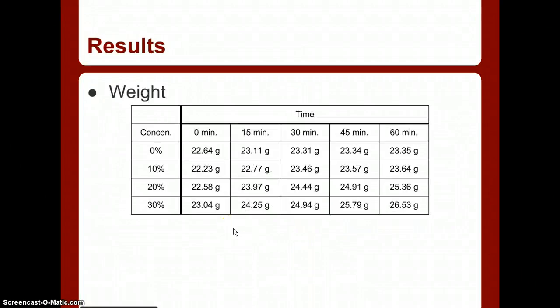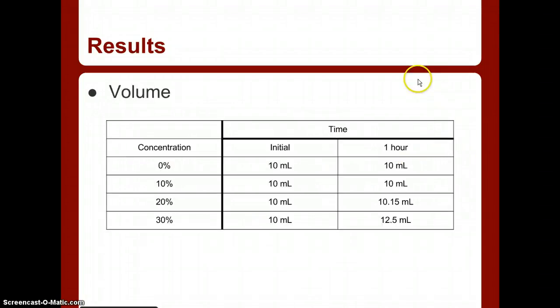Okay, I paused and went back a second just to make a correction. These two here generally change the same in weight, but as you move along, this one gains more weight as the 0% concentration. So then we did volume, which again shows a general trend. As the concentration goes up, the larger the volume.